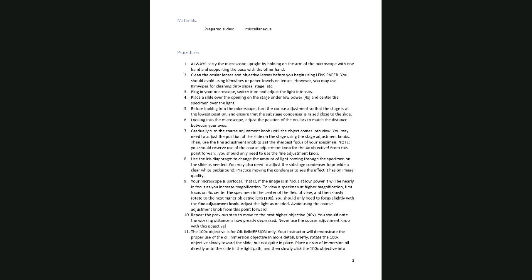Now, when you're finished looking at that slide, there is something that students always do, mostly because they're taught to do this, and I don't know why, because it makes no sense to me. But when you're finished with that slide, tell me, how do you remove that slide and prepare for the next slide? What would you do? Step by step, tell me, what would you do?